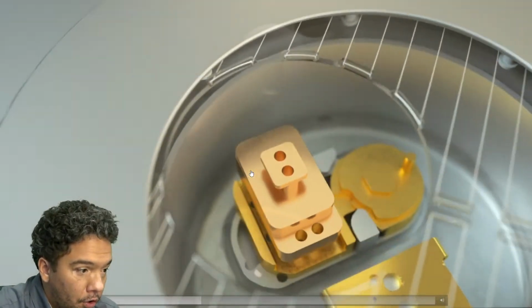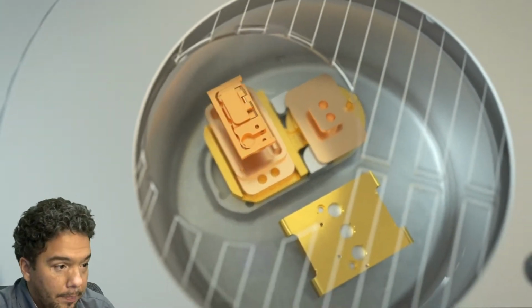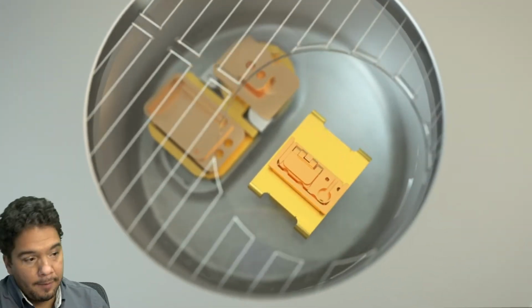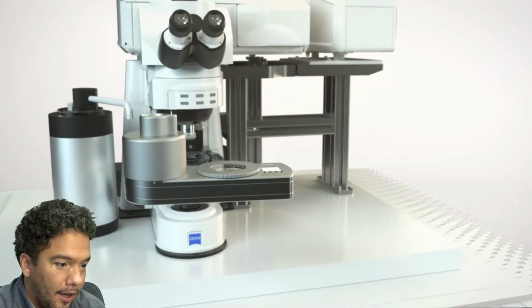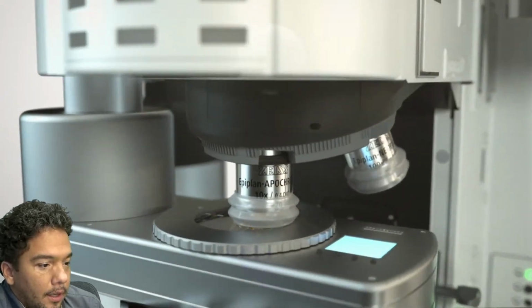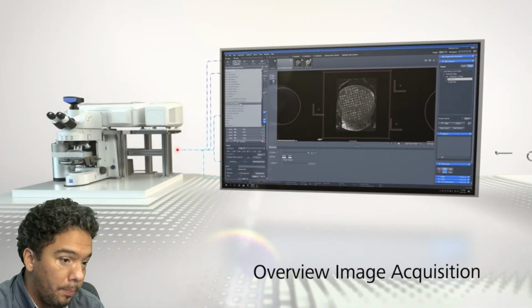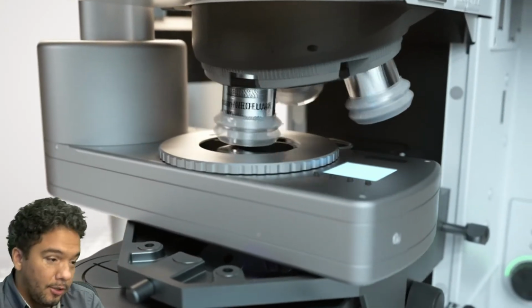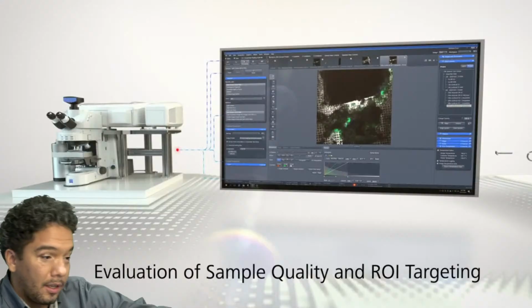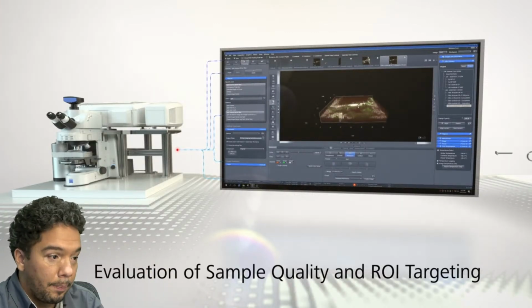In a previous episode, you can see more detail about this, where Amira, our guru here in LSM, describes how to screen your sample and get your best sample, because this is so important. You don't want to waste time on preparation. If you don't have the right preparation and you go directly to the electron microscope, you are wasting time. With the LSM, you are preventing that.